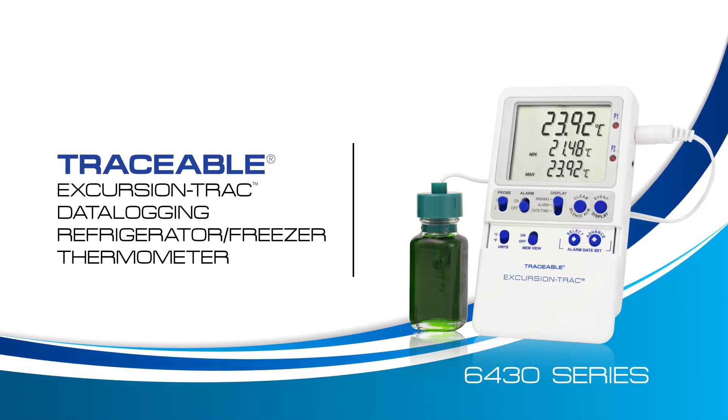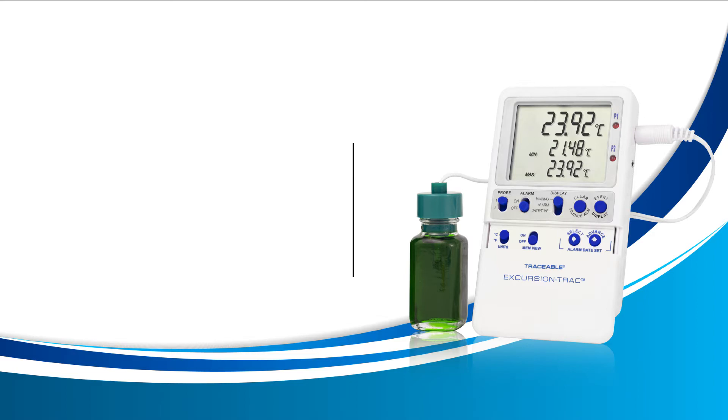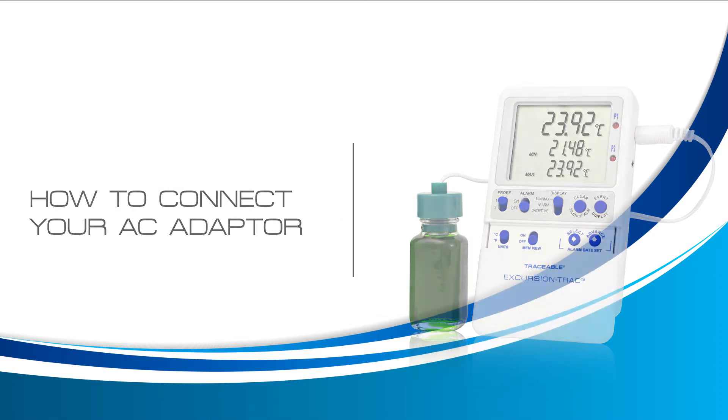Welcome to a Traceable Products instructional video for the Traceable Excursion Track Thermometer. In this video we will learn how to connect your AC adapter. Let's get started.